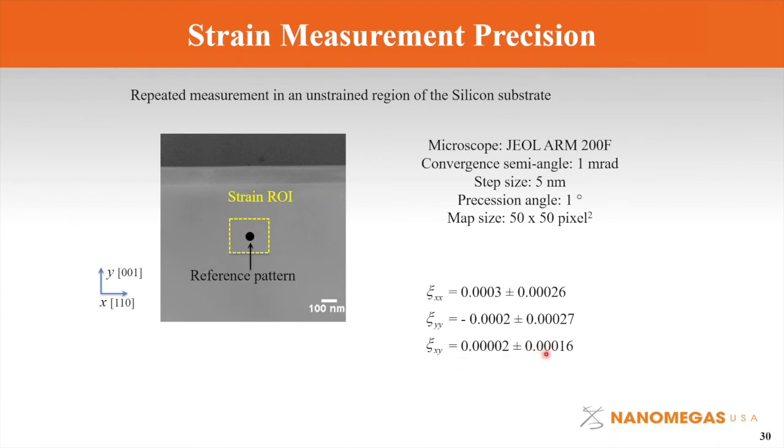You can get 0.02, 0.03. And this is obtained off a real world specimen. I like to call them commonplace specimens because they're just focused ion beam prepared. It's not one of those specimens you come by every once in a while with super good quality, minimal damage and all.